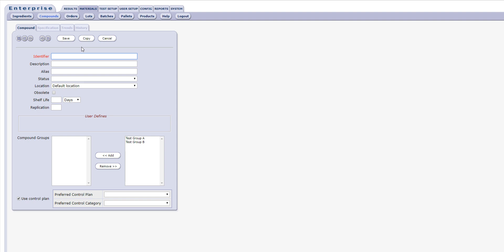The process begins by entering the compound's name, and the name field allows a maximum of 50 characters. Once you have named the compound, click Save.